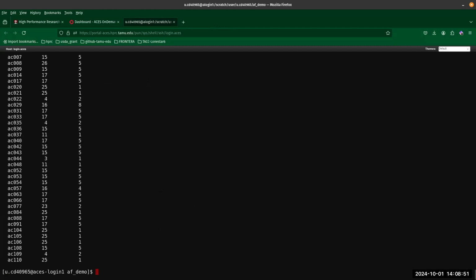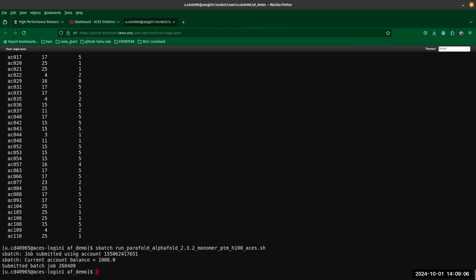I'll check the GPU availability again. There's still, it's like a few people may have submitted their job. I will go ahead and submit this. And I'm just hitting tab to autocomplete. All right, so at least we got it submitted. We have a job ID.